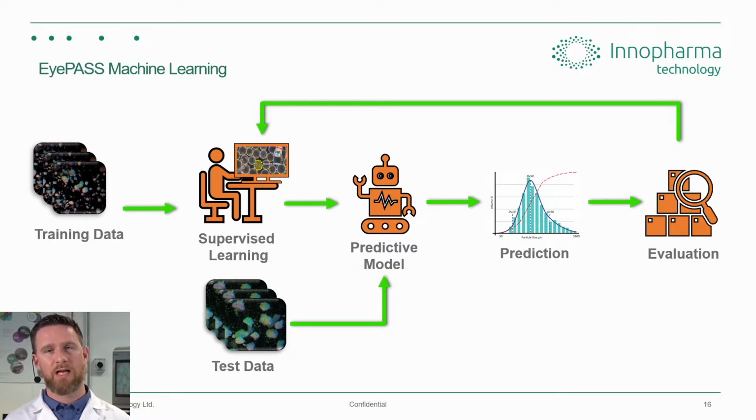And this is done the standard way any particle sizing would be done. It's compared to known standards and a measured result. But the great thing about machine learning is it's more flexible in terms of it can be iterated. We don't have the traditional algorithm method of image analysis that's fixed. So this means that we can continuously improve the model. But that's to say, after we roll out a predictive model, it's a locked algorithm.